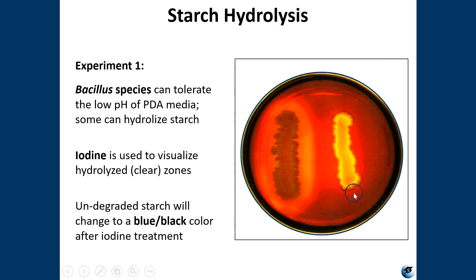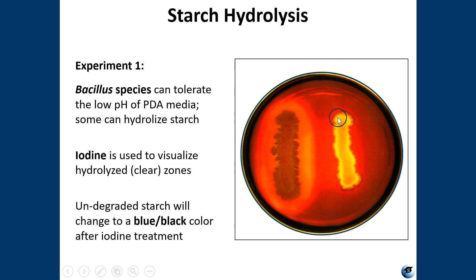Iodine has been added to the surface of the plate and it reacts to make a dark color. The specimen on the left shows a clearing zone around the bacteria — that's where the starch has been hydrolyzed, the zone of hydrolysis. Over here you don't see that clearing, so that means this specimen is negative for starch hydrolysis.